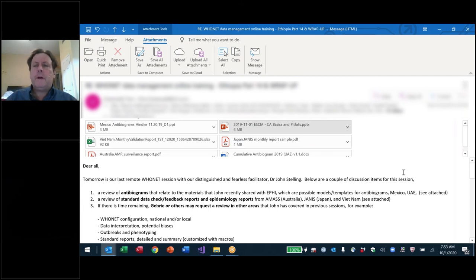If you believe the microbiology data quality, then you can use these analyses for epidemiology and statistics and outbreak detection. If you don't believe the microbiology data quality, I still want to collect the data. I think it is a good thing to collect bad quality data, but don't publish it. Use the bad quality data to identify the problems in data quality and to improve them. For example, if I get data from 20 laboratories and two of the laboratories have very strange results, staph resistant to vancomycin, a lot of Klebsiella sensitive to ampicillin, I say, I don't believe the data from your laboratory.